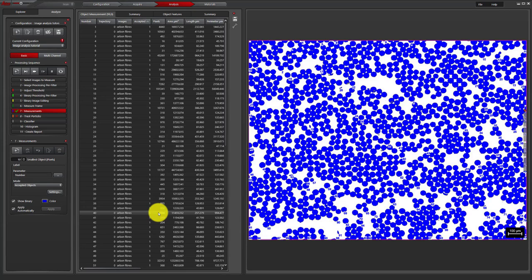You can click on your image to select a specific particle. You may notice, as we see in this image, that a few of our particles may have stuck together, forming one larger particle. The software can add filters to our image to help analyze our data. In this case, I'm going to add 2 filters to our image to help.